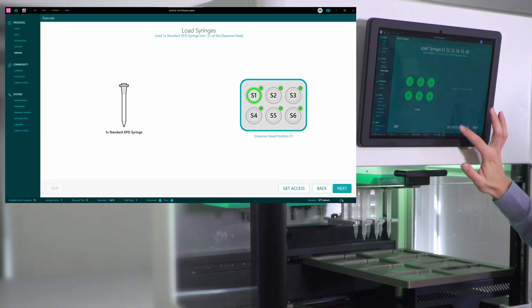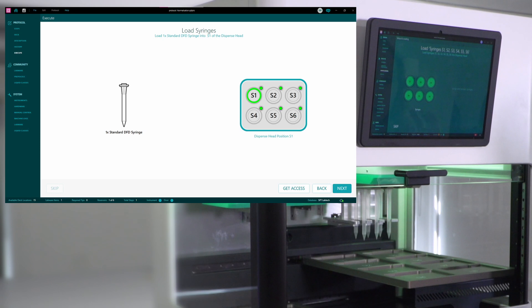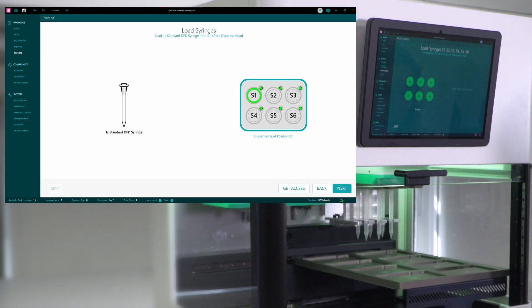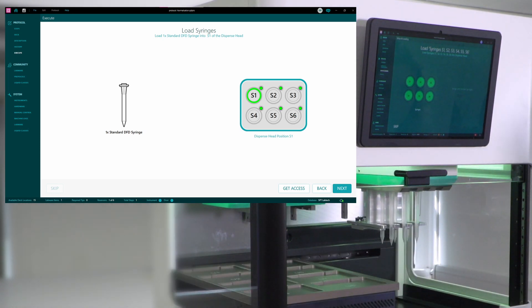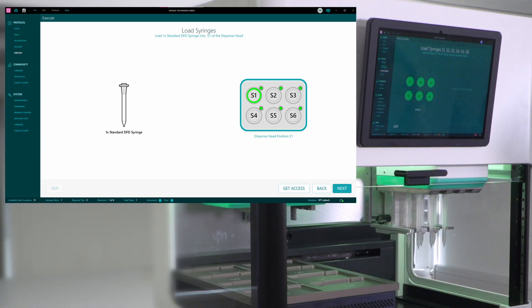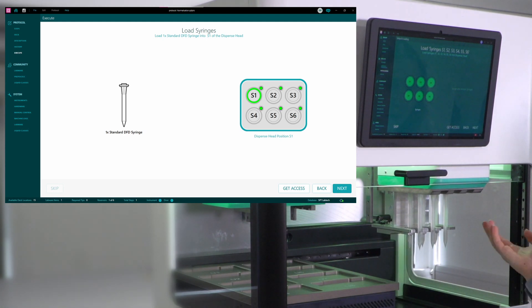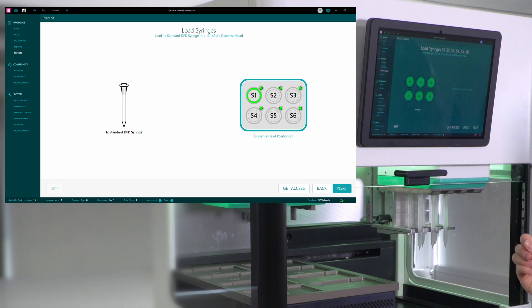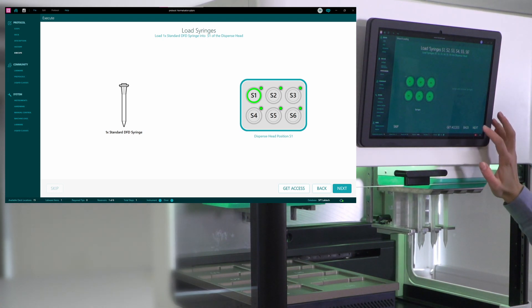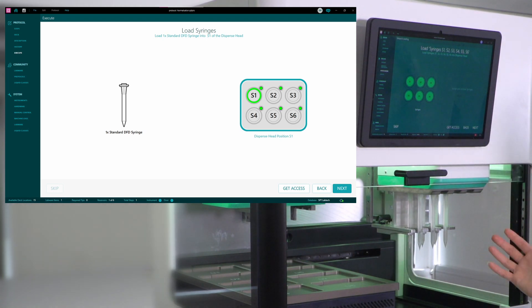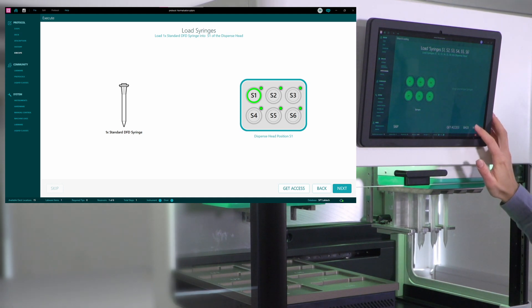But in case you do need them, you can just get access, press get access, and the instrument will bring the dispense head forward and open the clamps so that the syringes can be exchanged and loaded. Now, in my case, I don't need to change anything, so I can just proceed.